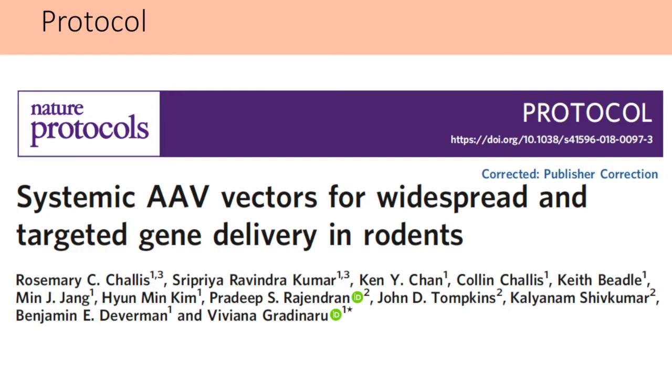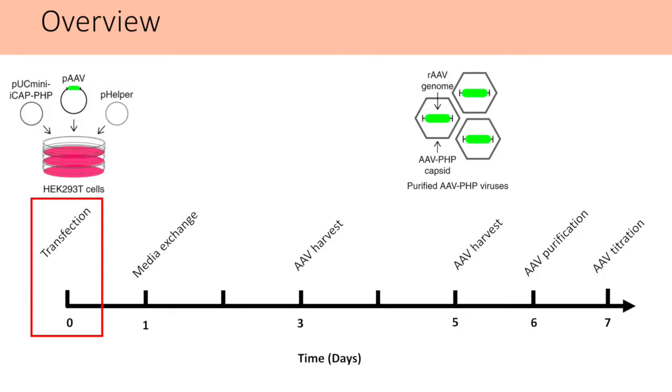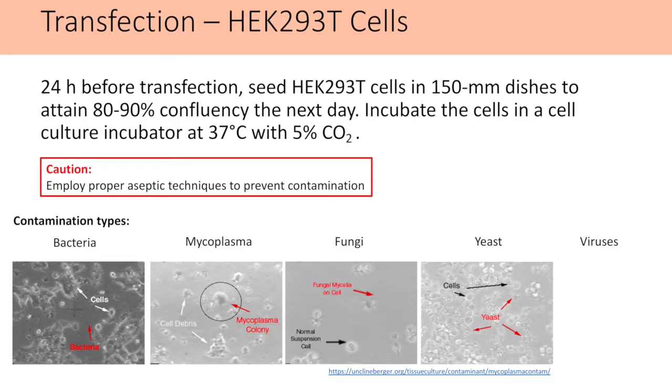These protocols are described in detail in our paper in Nature Protocols in 2019. The entire process takes about 8 days, starting with transfection on day 0 here. HEK293T cells are used, and normal care and considerations should be maintained in their passaging.